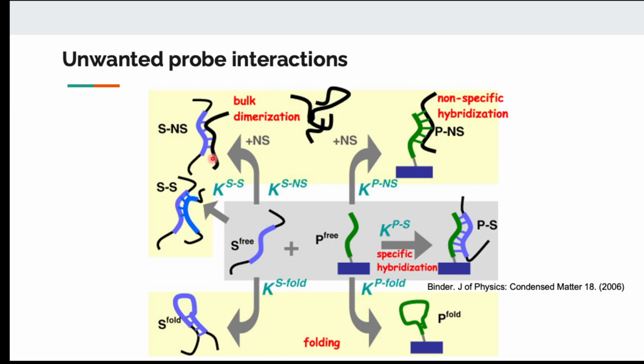So you can have an unwanted interaction among your sequence. And sometimes the nucleotide itself can fold, because a nucleotide on the long strand can form secondary structure. So it can fold into itself, and this will no longer be active. It will not bind to your gene. So without good design, your array can have a lot of wasteful spots that don't detect anything, or it detects too many things, and it cannot give you specific information.